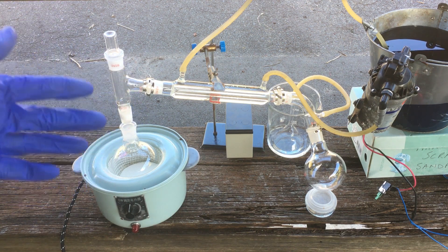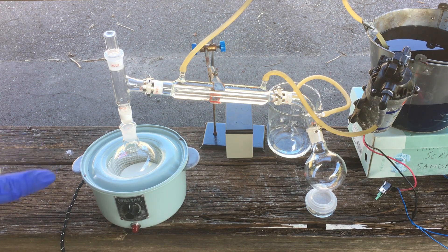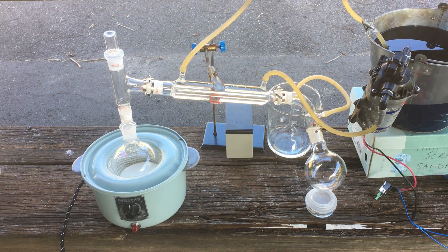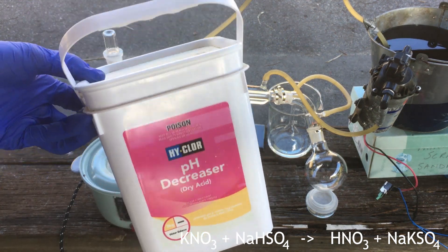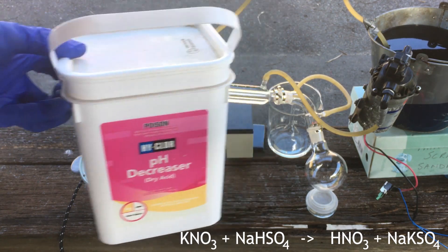Sulfuric acid is relatively difficult for me to get hold of, and I don't really want to be wasting it on a process like this where we'd be using quite a significant portion of it. Luckily there is another method which will generate nitric acid, and it's a lot cheaper for me to do — that is to react our potassium nitrate with sodium bisulfate. Sodium bisulfate is a relatively strong acid that is much, much cheaper for me at least.